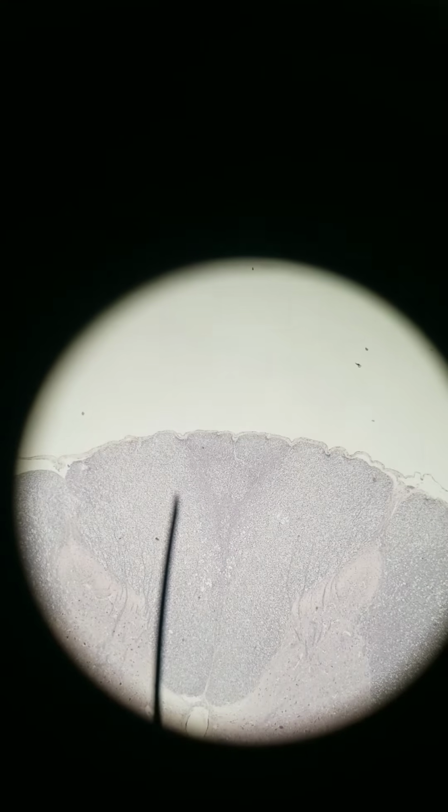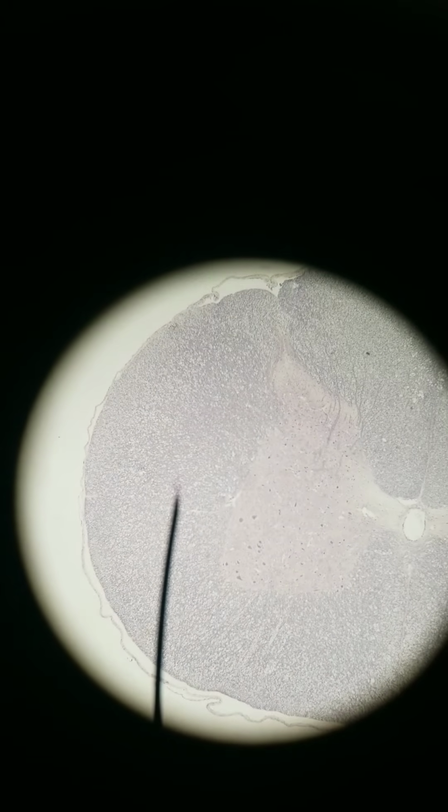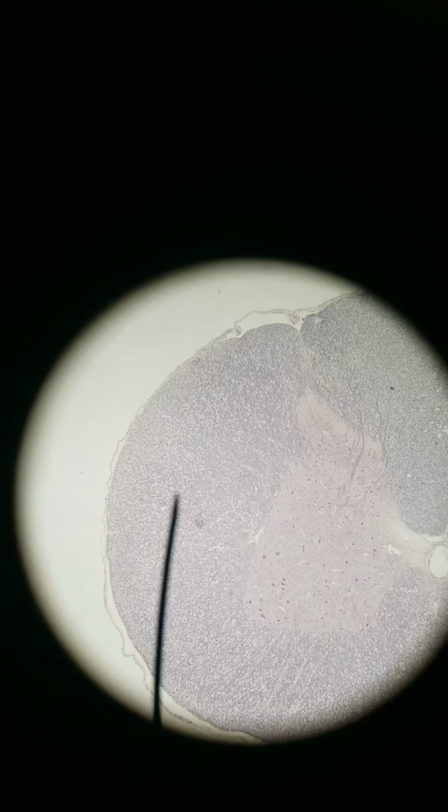Up here in the white matter, this is the dorsal or posterior columns. Posterior column, posterior column. We have lateral white columns, and then ventral anterior columns. Another word for column is funiculus. I think column is easier. So anterior white column, lateral white column, dorsal posterior column.